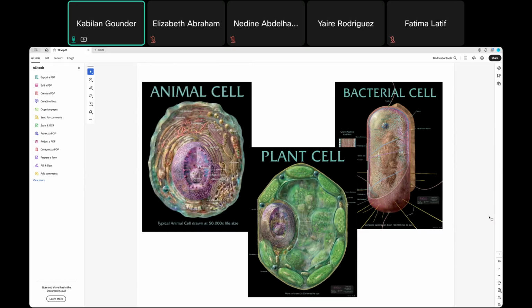So today we are going to continue with microscopy related to the electron microscope. In the last two classes, I think we discussed what a scanning electron microscope is, the basic principles, applications, and some examples of how we can get more details about the images.